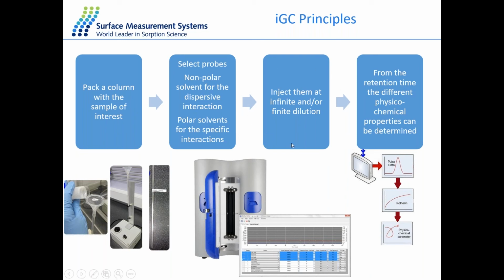We can go ahead and go to the software and choose how to inject them. So we can do very small concentrations of infinite dilution or larger concentrations. We'll then start the experiment, and depending on the interaction between the probe molecules and your sample, we'll be able to obtain different peaks at different retention times, and to analyze these, to obtain different physical-chemical properties.